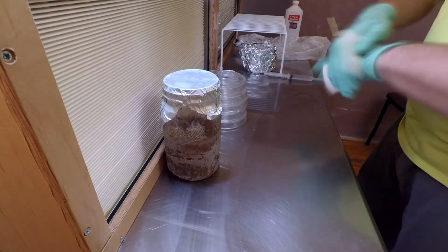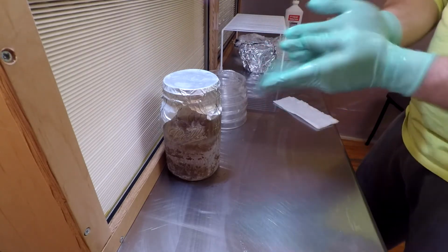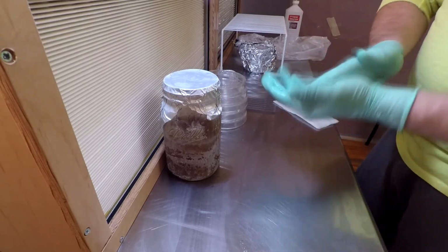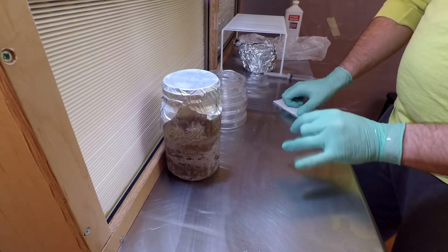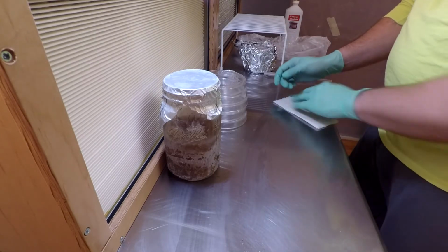because I don't know if I really need to spread them thin, and even if I do, I might still have some bacteria in there that I'm going to have to select the good mycelium away from the bacteria and transfer it to a new dish to clean the culture up.